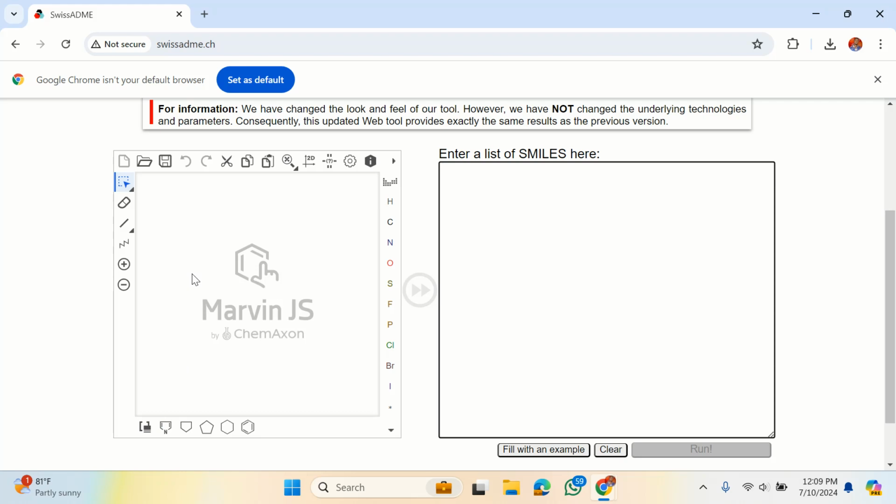Yeah, in 2D. The same way, after drawing the compound, it appears in 2D. Yeah, before you now convert to 3D, you simply paste it here, and once you paste that, you can now click your run. This run will become highlighted.